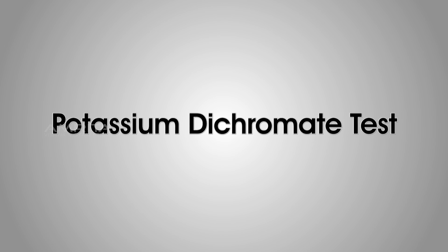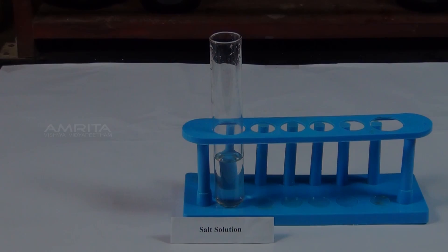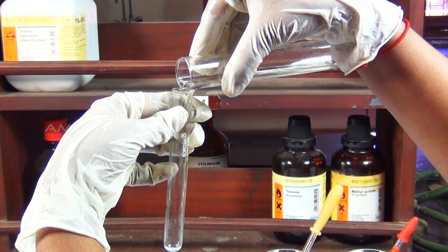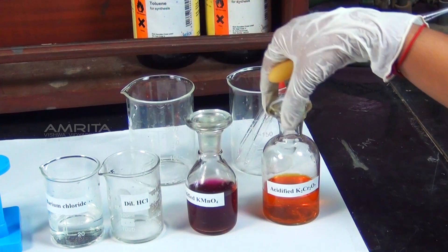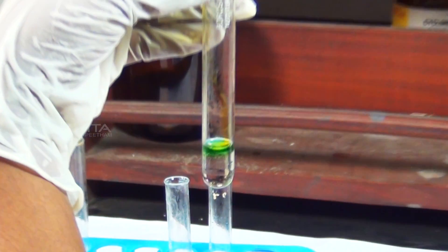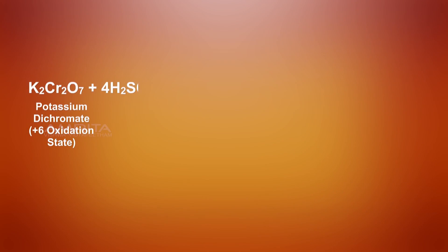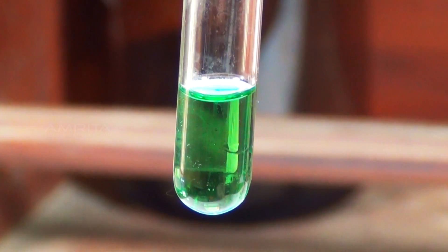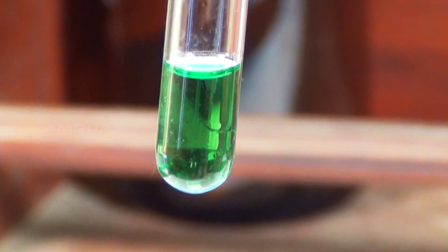Potassium Dichromate Test. Materials Required: Aqueous solution of the salt, acidified potassium dichromate solution, test tube, and a dropper. Procedure: Take a portion of the aqueous solution in the test tube. Using the dropper, add a small amount of acidified potassium dichromate solution into the aqueous solution. In the presence of acid, sulphite reduces chromium in potassium dichromate from +6 to +3 oxidation state, and sulphite undergoes oxidation to form sulphate. Chromium in the +3 oxidation state gives green colour to the solution.